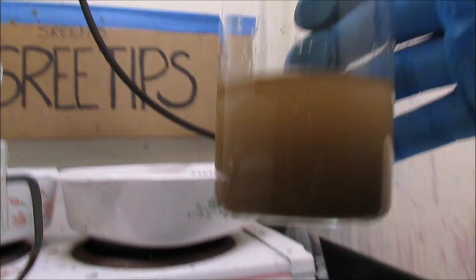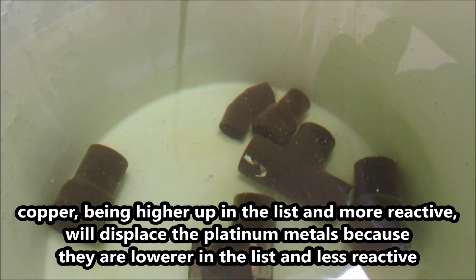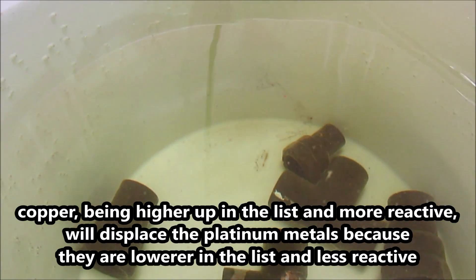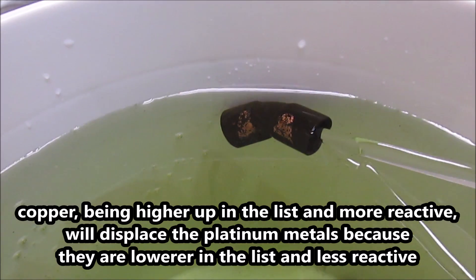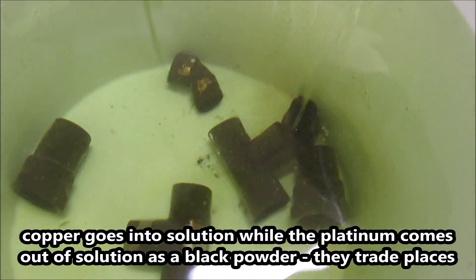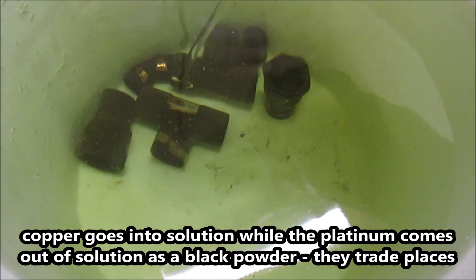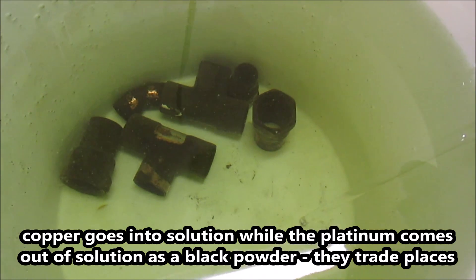Here's the gold that was in that temporary stock pot — it's a significant amount. I'm going to let that settle out and add the liquid to the stock pot. Look over here at the newly initiated stock pot — there's already metals starting to cement out onto the copper. Those are going to be platinum group metals mostly. All the gold should be out of this solution, but the platinum is going to be cementing out on these pieces of copper. You can see it falling off to the bottom already, and it's just been in there for about five or ten minutes. That's an example of how the reactivity series of metals works.